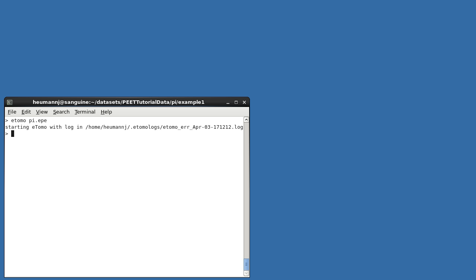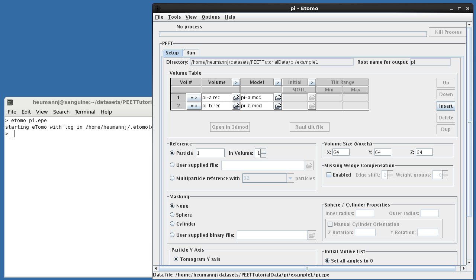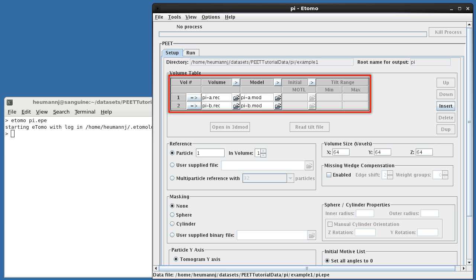Appropriate settings have already been entered into each sample project, so let's open project pi.epe in example 1 and take a look at those settings. You can see that we've specified the input volumes and associated models in the volume table. The initial MOTL and tilt range settings are not needed here and will be covered later.